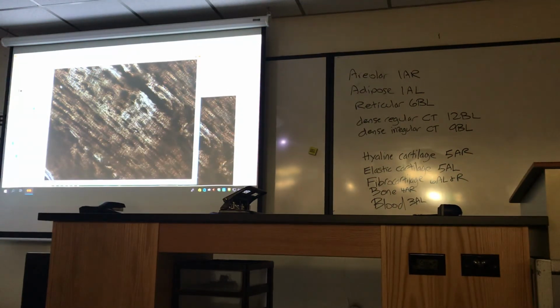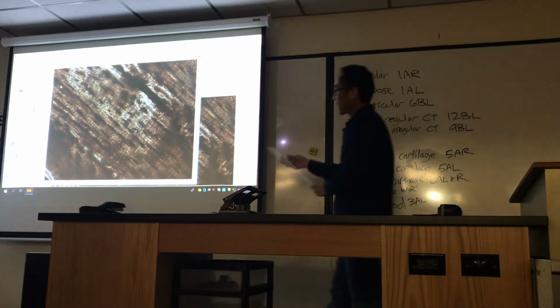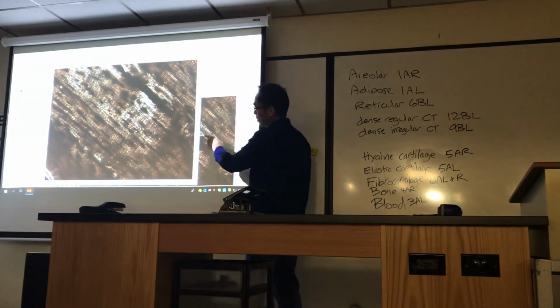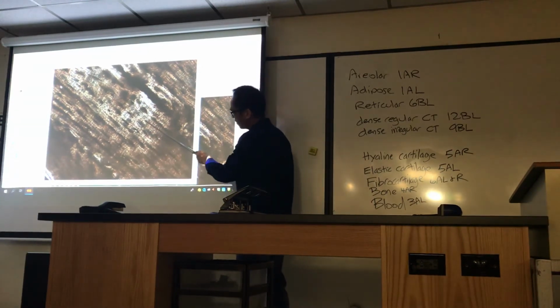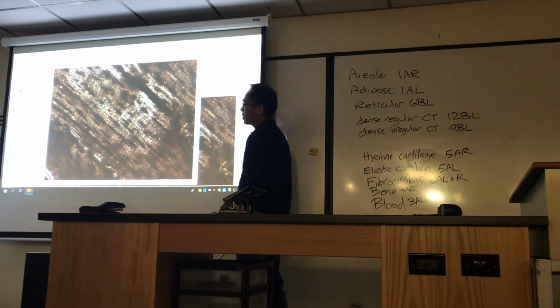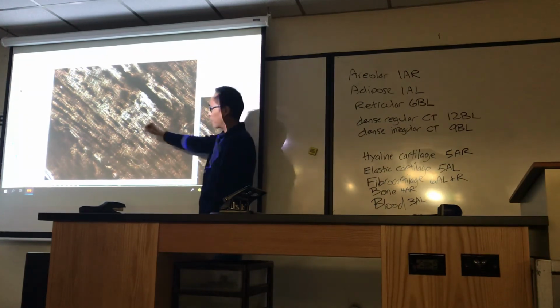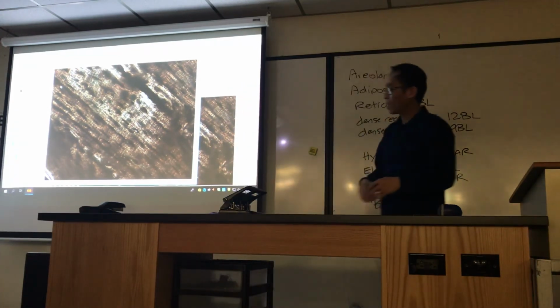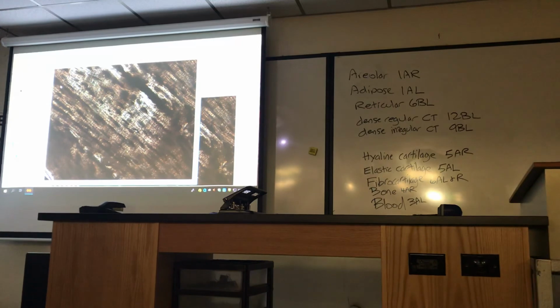So this is bone. Let me point out where you're supposed to identify. The osteocyte is a cell. I think that's one right there. You can see that it's layered. And you see like the little tiny cracks? It's hard to point to, but it looks like shattered glass almost. And those are little canaliculi, these microscopic canals for the blood to diffuse through all the layers of bone tissue. All right, so bone, then blood.